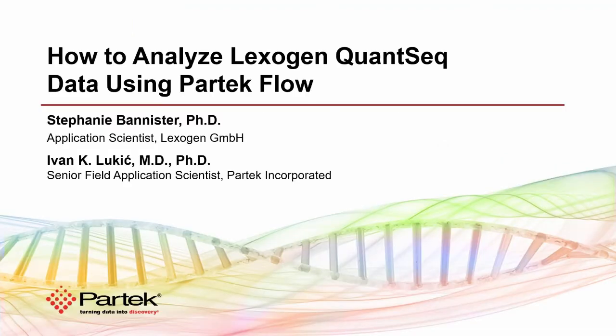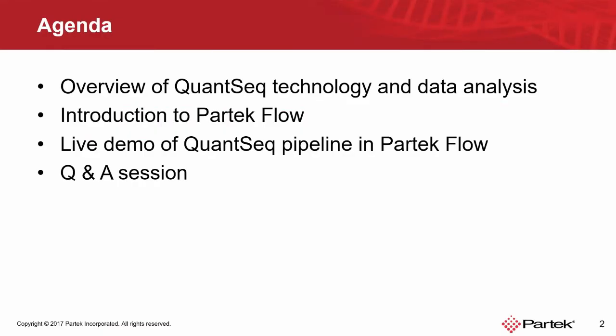We will start the webinar with an overview of QuantSeq technology and data analysis. Then we will briefly introduce Partek Flow, while the main part of the webinar will be dedicated to a live demo of analysis of QuantSeq data in Partek Flow. At the end, it will be your turn to ask anything on the webinar content or our analysis solution in general.